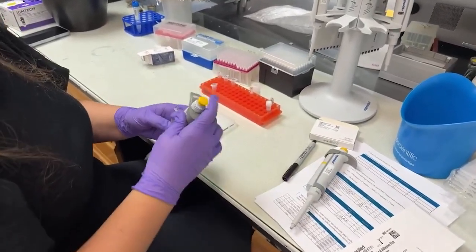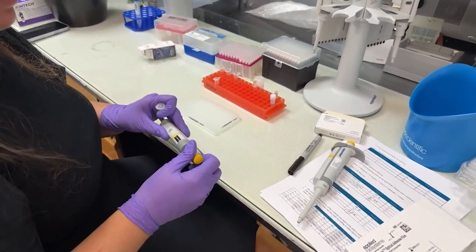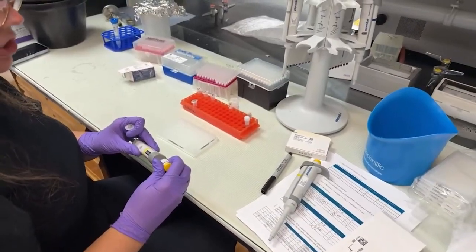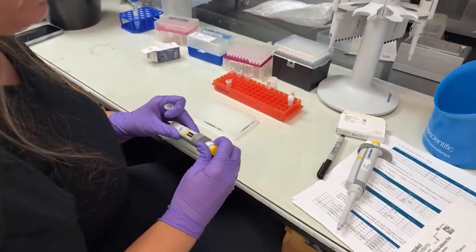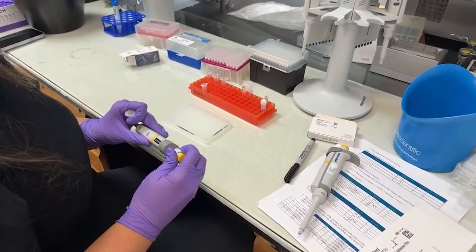One other thing I hope you notice is that when I was working with all the different components, I changed tips between each one. And that does a couple of things.